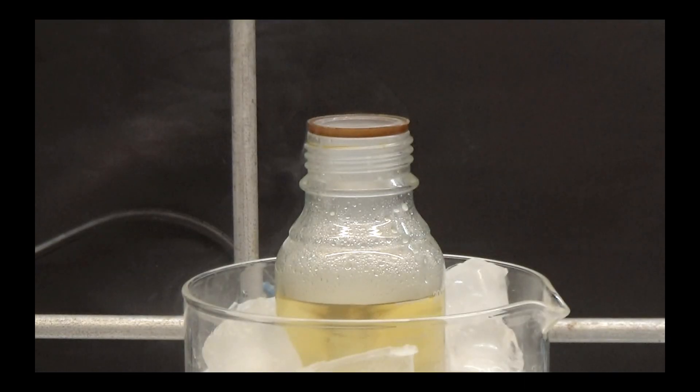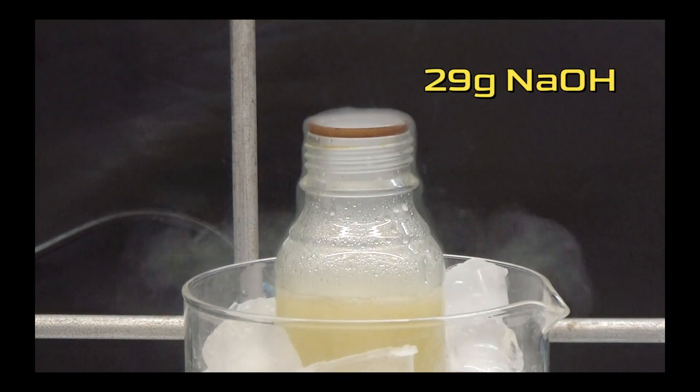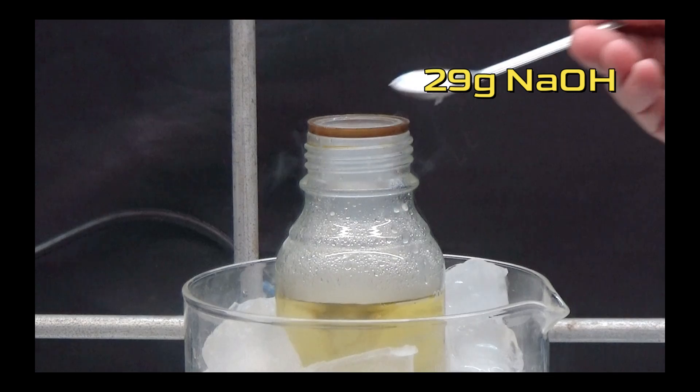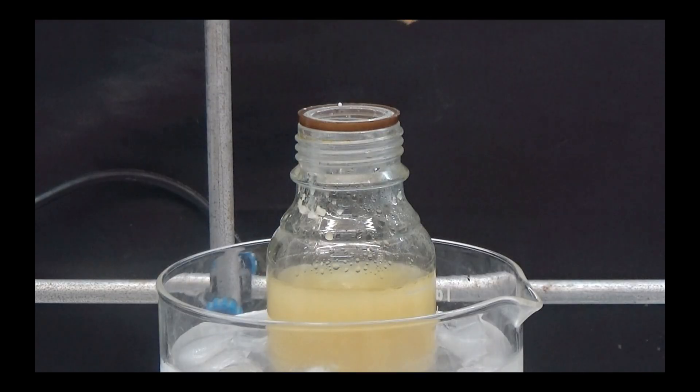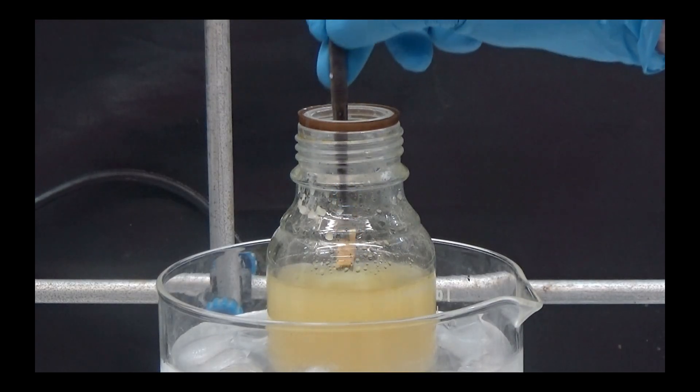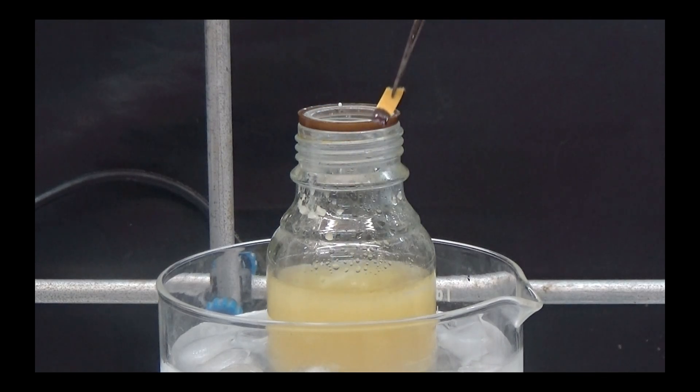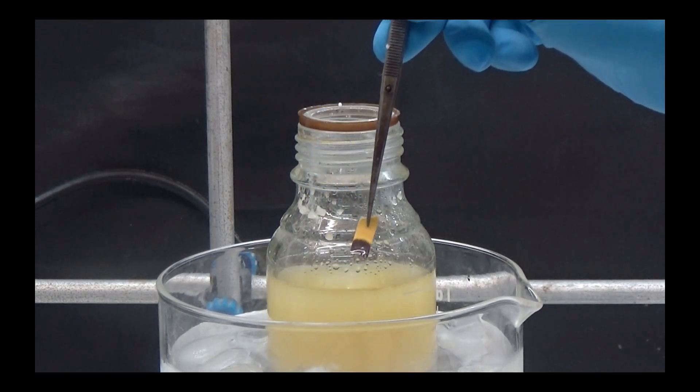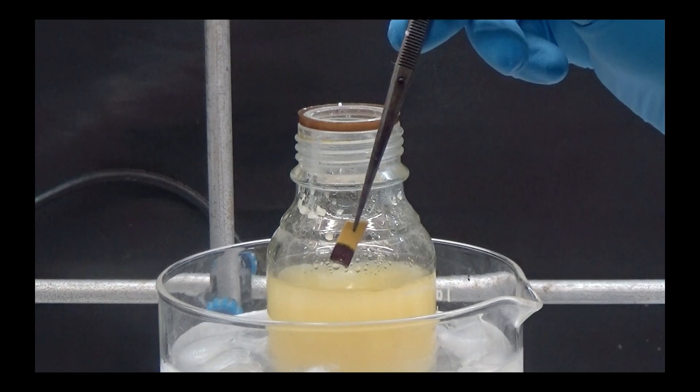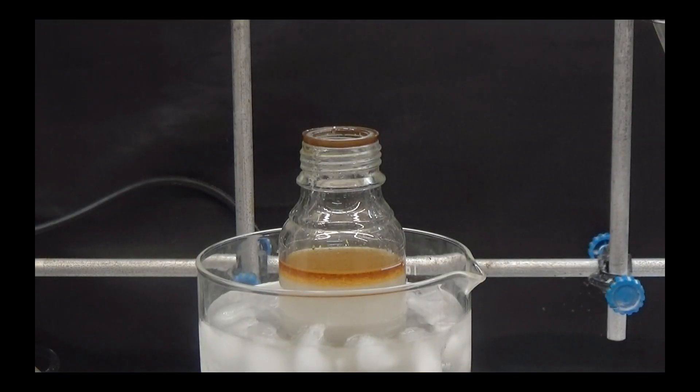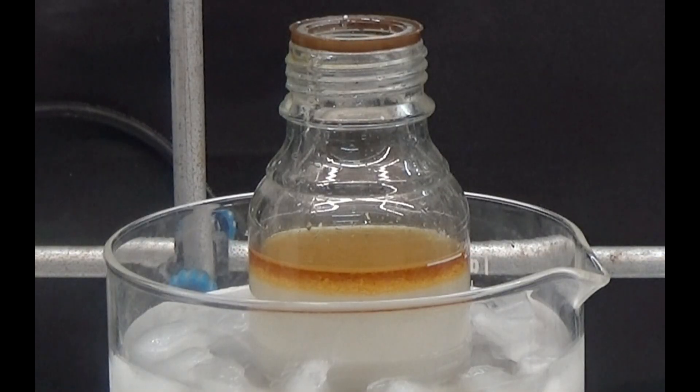Separate the aqueous phase and place it in a container immersed in an ice bath. Slowly add 29 grams of sodium hydroxide to separate the aniline. We must check the pH using indicator paper. It is necessary for the pH to be alkaline. At this point it is observed that the aniline has separated from the water in the form of oil.